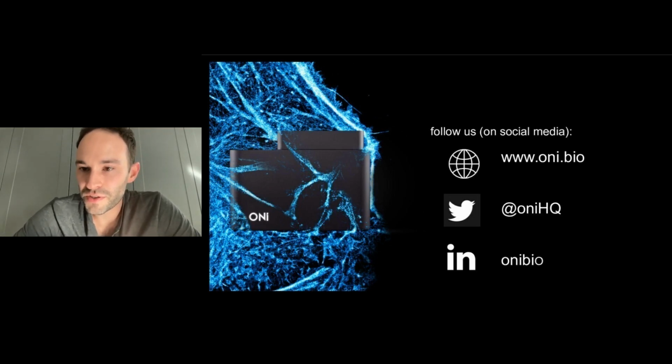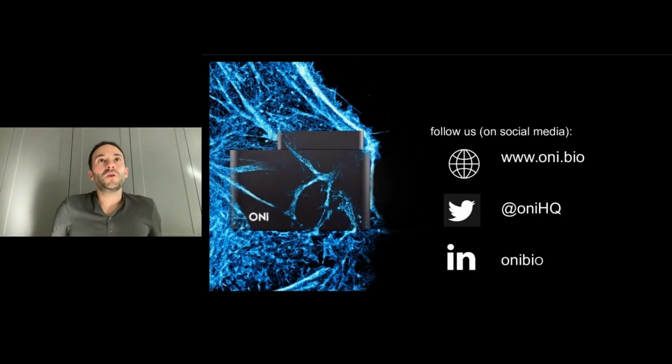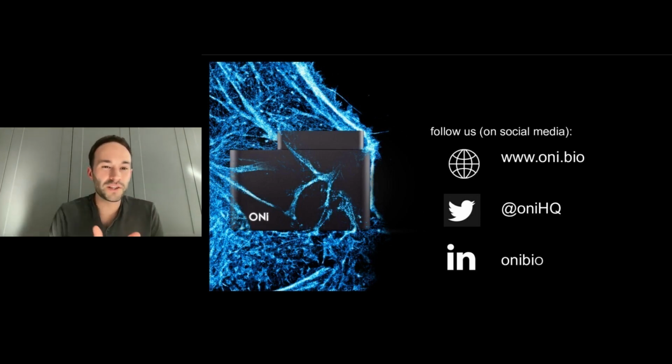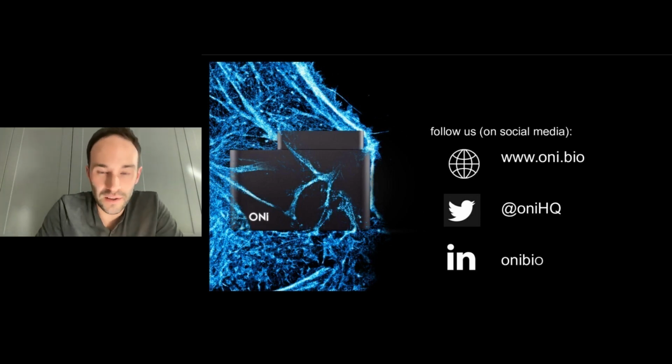So the question is, what's the lowest resolution that we can resolve? In principle, there is no lowest resolution because the resolution, when it comes to localization microscopy, is on a molecule by molecule basis. So we tend to talk about precision when it comes to localization microscopy.